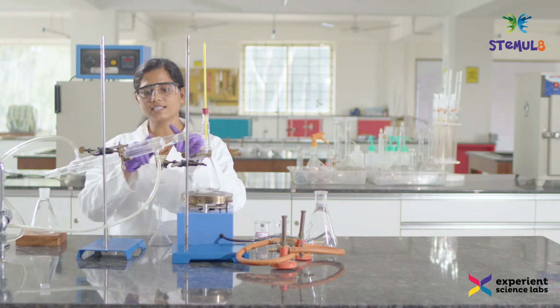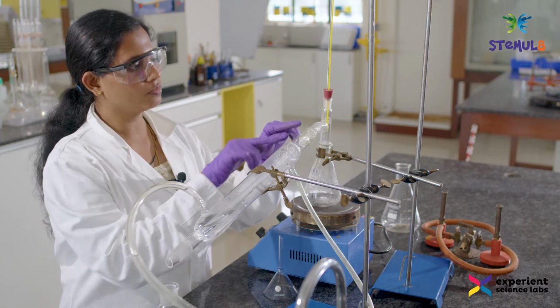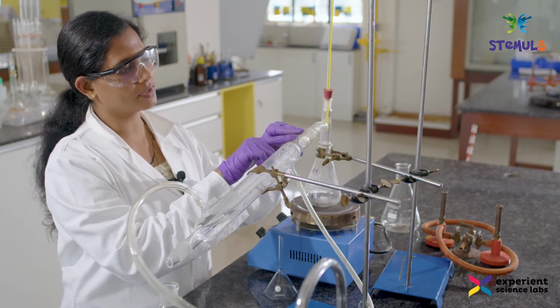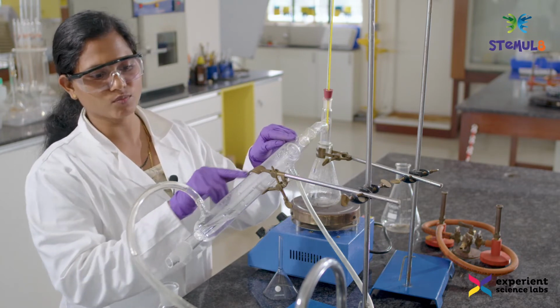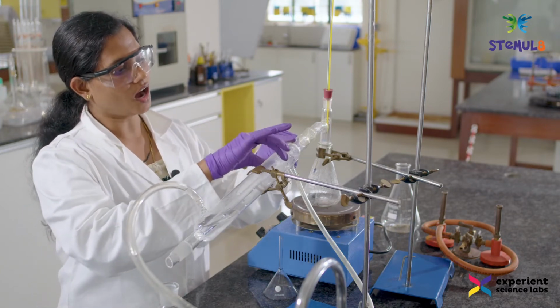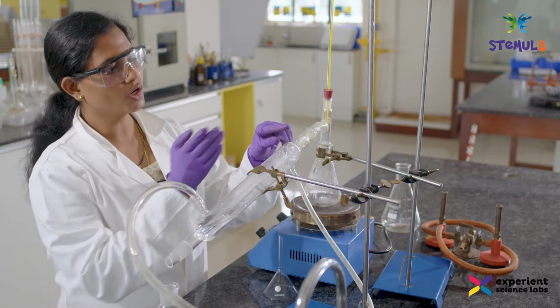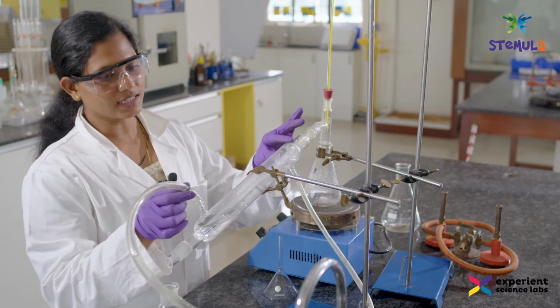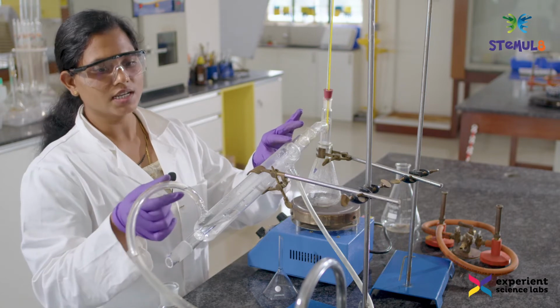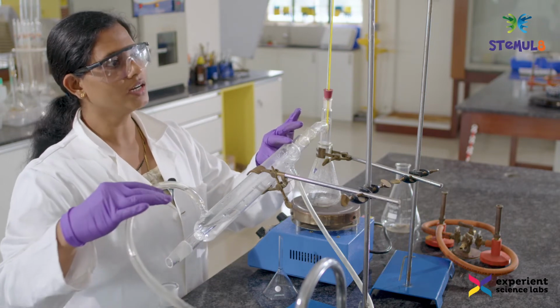The condenser consists of two tubes wherein there is an inner tube through which the hot vapors enter from the top and move towards the bottom side, and there is an outer tube through which water enters from the bottom upwards, and this water is being passed through these water pipes, which are in turn connected to a tap.